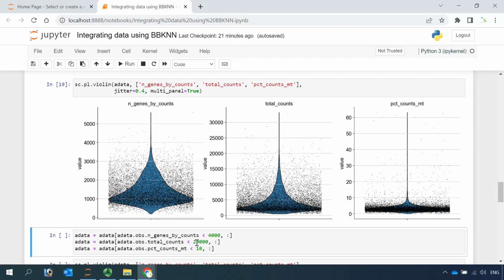The purpose is just to get rid of low quality cells for analysis. It really depends on your analysis. If you are looking for a rare normal cell population, you can probably keep all the cells. If we want to study signaling pathways and gene changes for known cell types, you can use more strict selections. For example, only keep cells with necessary genes, and we can use even the mitochondrial DNA percentage below 5%.